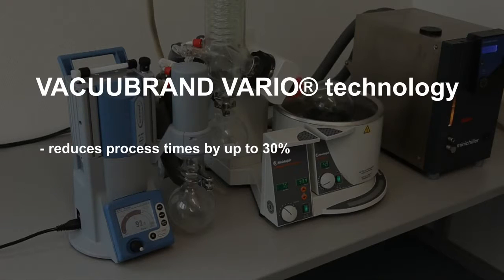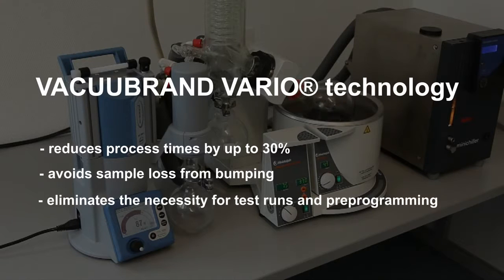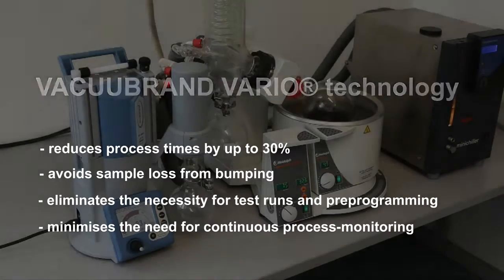Vacu-Brand Vario Technology reduces process times by up to 30%, avoids sample loss from bumping, eliminates the necessity for test runs and pre-programming, and minimizes the need for continuous process monitoring.